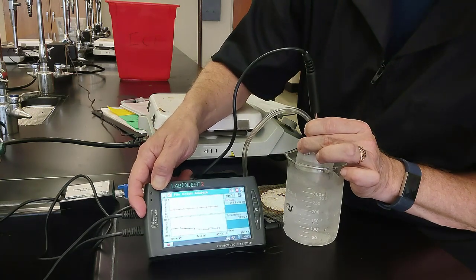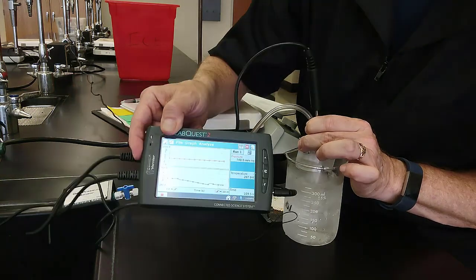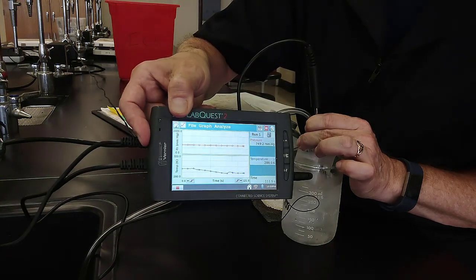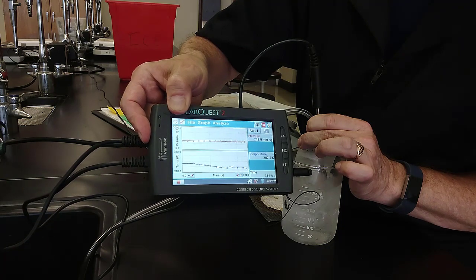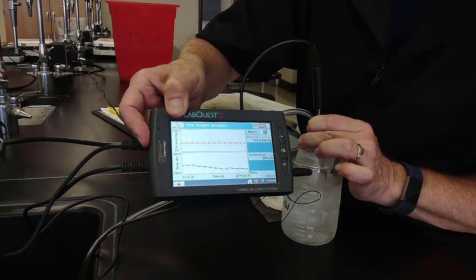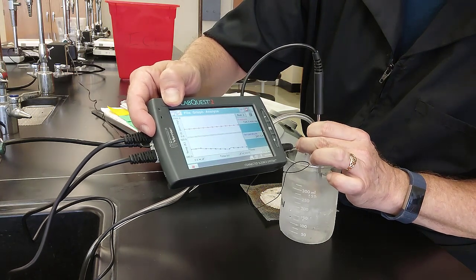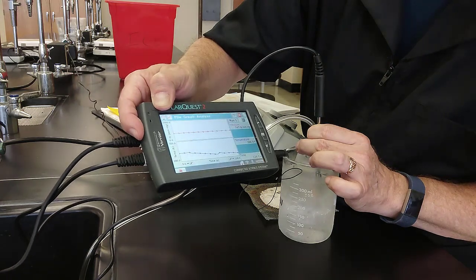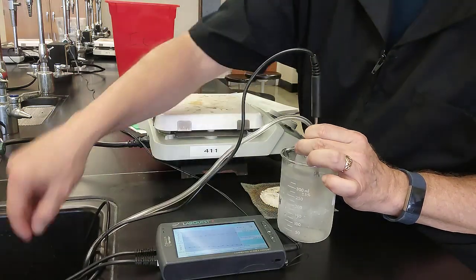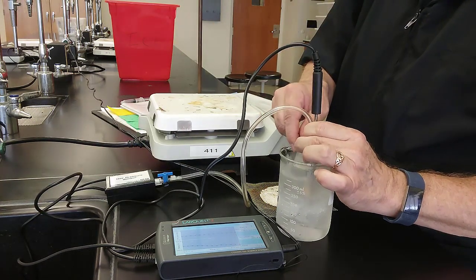So it's not a dramatic drop, but if we changed our XY axis on our graph, you would definitely be able to see it for sure. Change our y-axis. So our temperature is down at 286, and our pressure is now at 747.9. Still dropping. So every time the temperature goes down, our pressure also seems to go down.